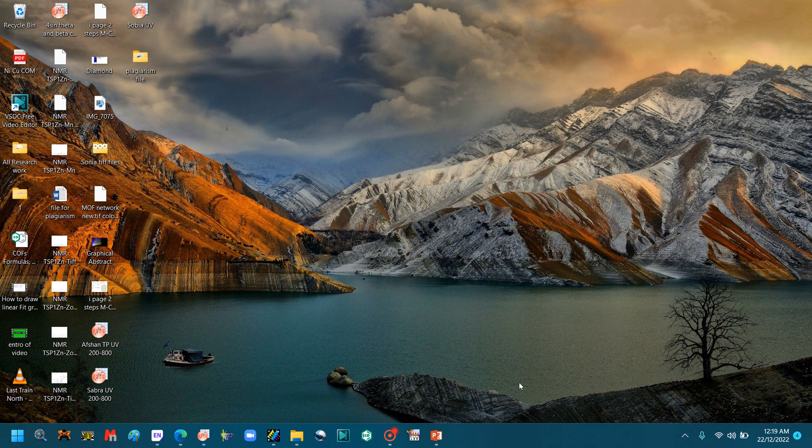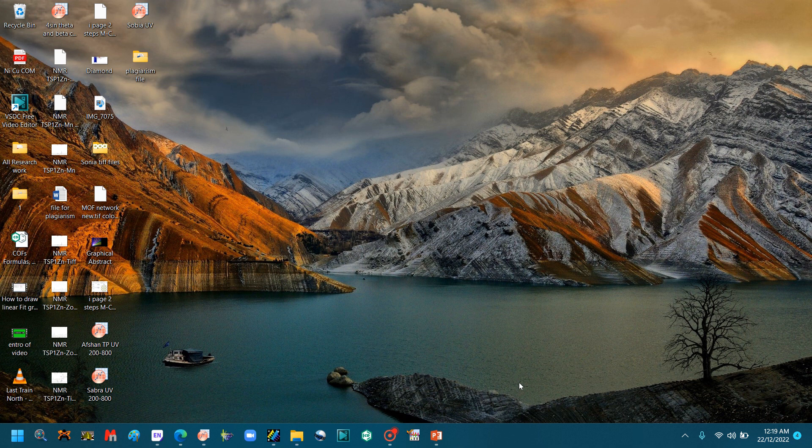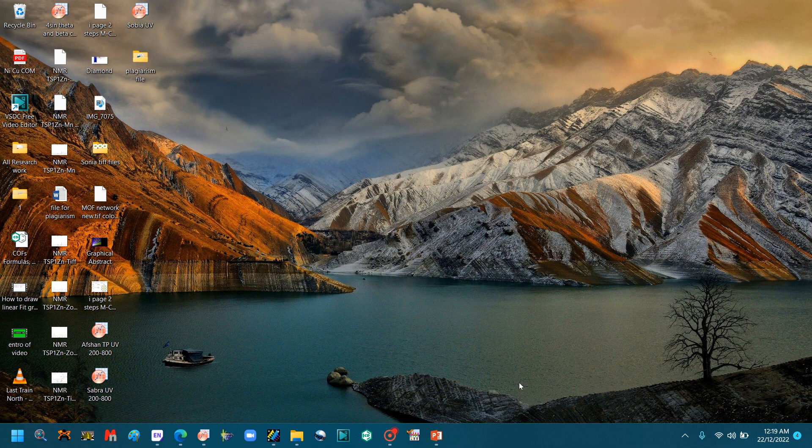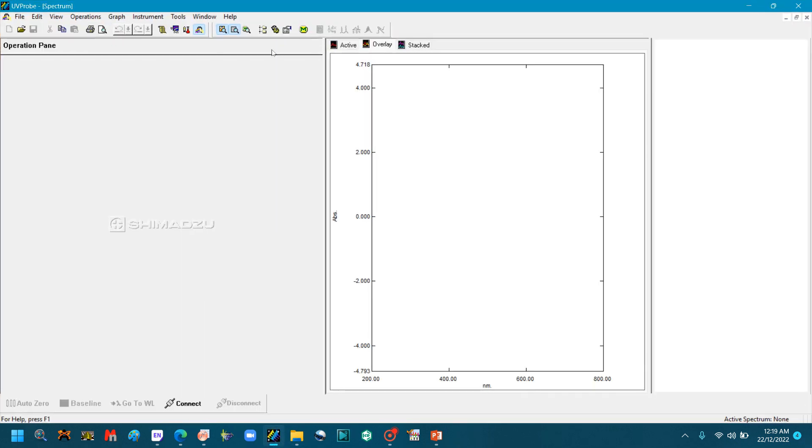In this video we will learn how we can draw a UV graph on the Origin software by taking the data from the UV-Vis software, and then we will make a zoom file on the Origin software for the UV graph. Finally, we will go to PowerPoint and combine both of these graphs and make the TIFF of that.